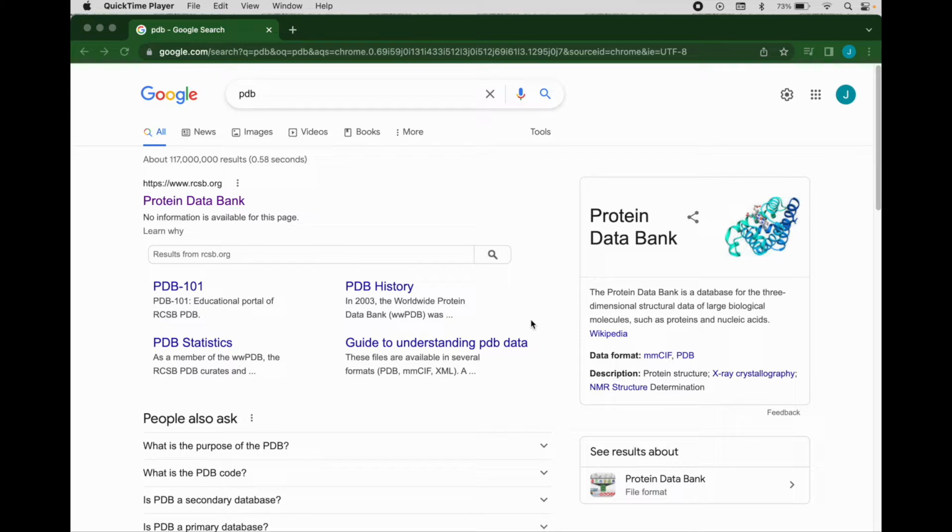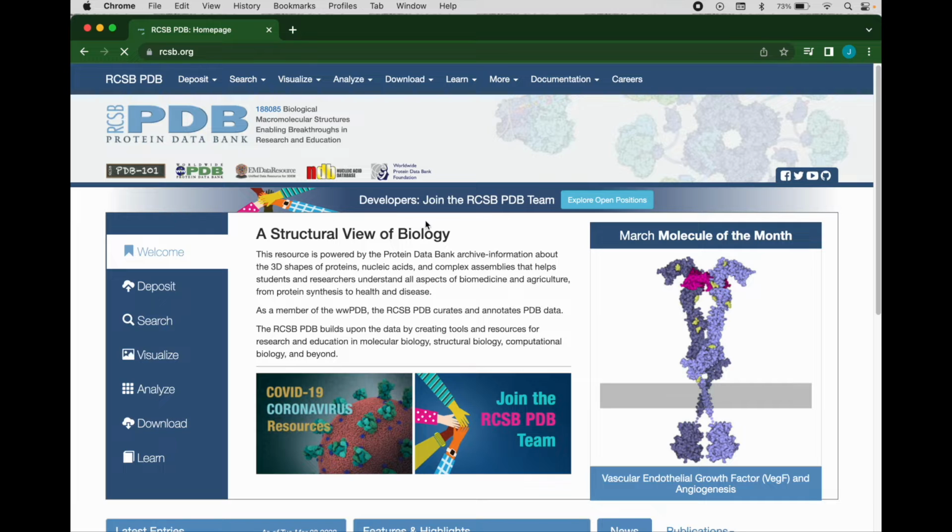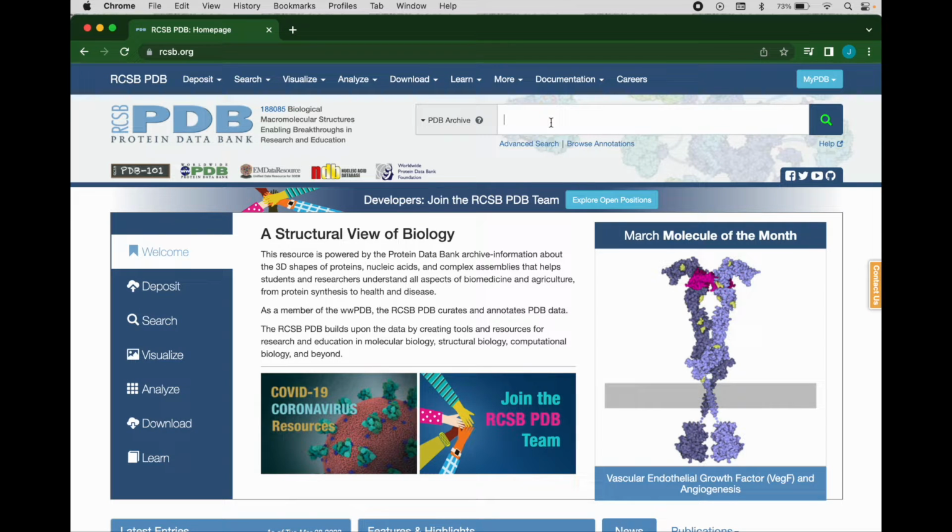Okay. So as you remember from the other intro molecular modeling videos, Protein Data Bank or PDB is the gold standard for storing and finding molecular models of proteins and other macromolecules. And so we're going to click on that. As this is loading, I want to remind you that you probably want to have a 3-button mouse. You can get away with a 2-button mouse on a laptop, for example, but if you have a 3-button mouse, try and get that out.